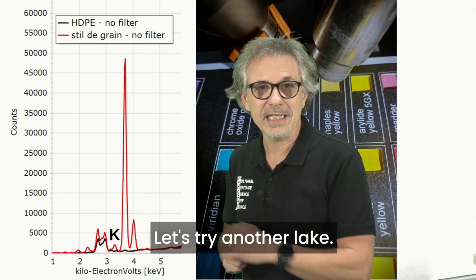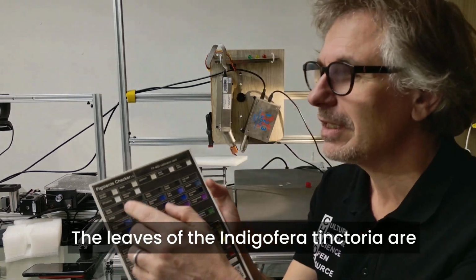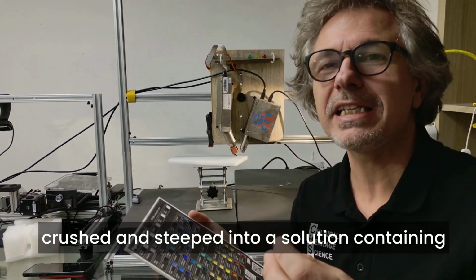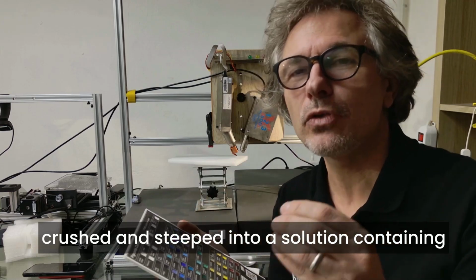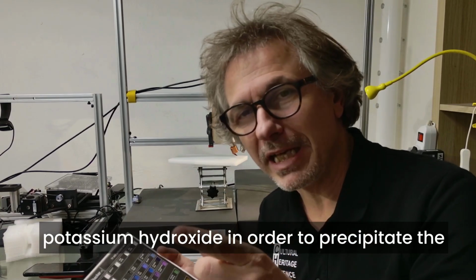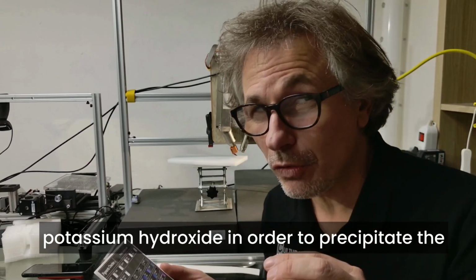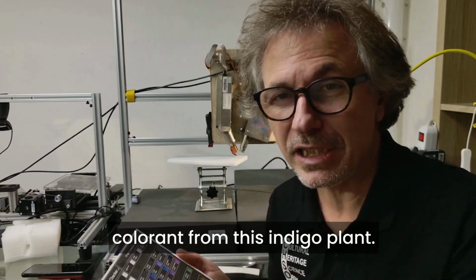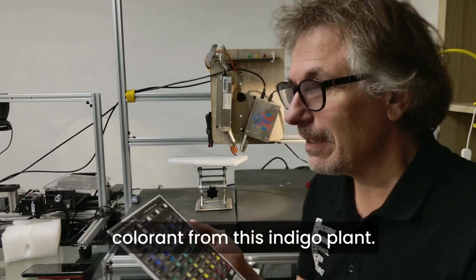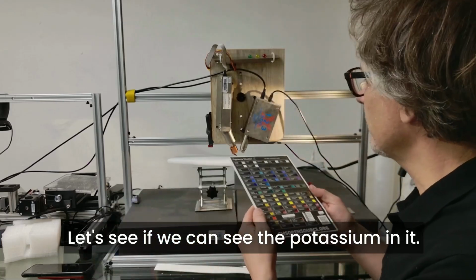Let's try another lake. The leaves of the Indigofera tinctoria are crushed and steeped into a solution containing potassium hydroxide in order to precipitate the colorant from this indigo plant. Let's see if we can see the potassium in it.